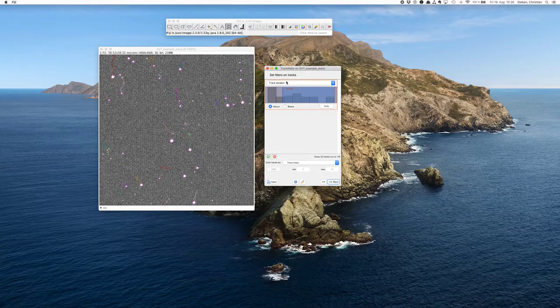Now we can filter the trajectories as well. For example, there are again many different filter parameters. I think the duration is quite nice. Speed, direction, and length, and so on. So I think duration is quite good. So we don't want to look at some sort of micro trajectory, so we only choose the ones that have a certain minimum length. So this is a bit arbitrary. I think I just put it here somewhere. Yeah, it's very close to the suggested value.